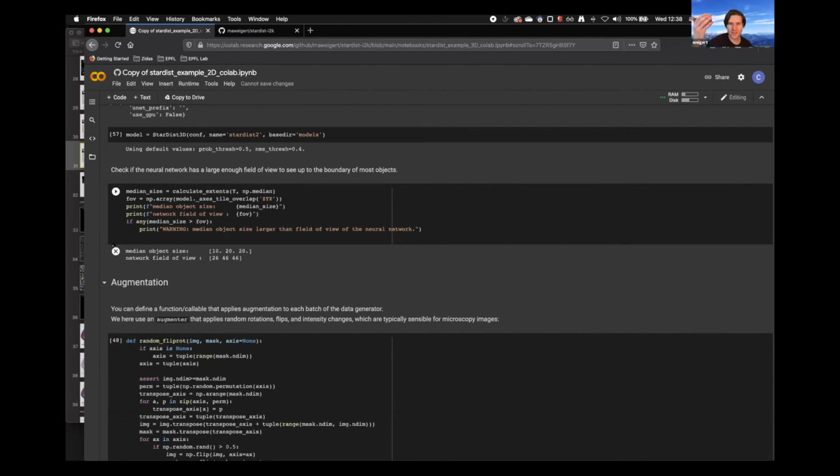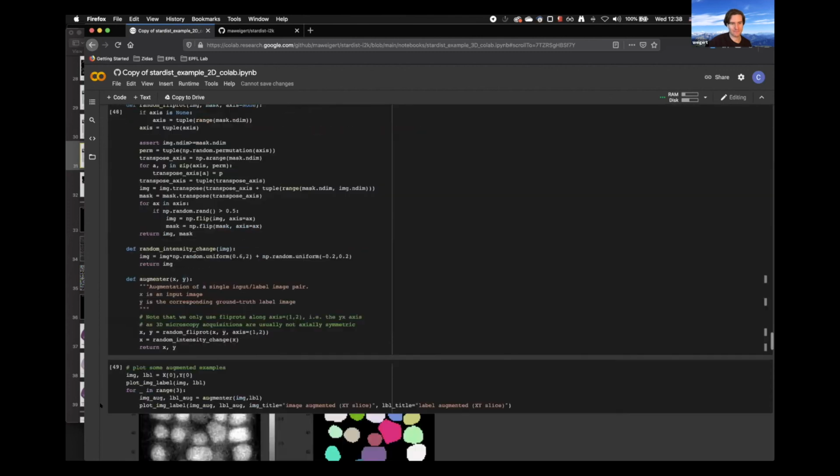Okay. So I was just thinking more if you want to exclude. Sometimes you have a phenotype, and you don't want that to be relevant for the segmentation, right? You want to exclude that channel because you want to do measurements based on that channel, and it should not be used for the actual segmentation. Then you should not include it in your channels because it will use that if it can, right? It will use whatever it gets. Okay, I understand. Yeah. Thank you.